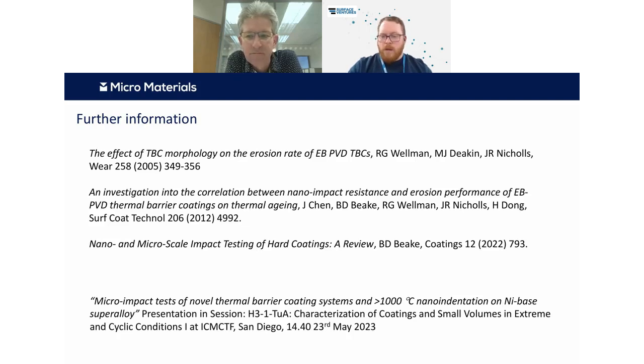Yes. We have a question from Rohit Sajan, who asks, are these testing methods suitable for any type of material, such as metals, ceramics, and polymers? We haven't tested polymers yet. We certainly have tested a few metals as well, and ceramics as well. And these things are equally suitable for all that.